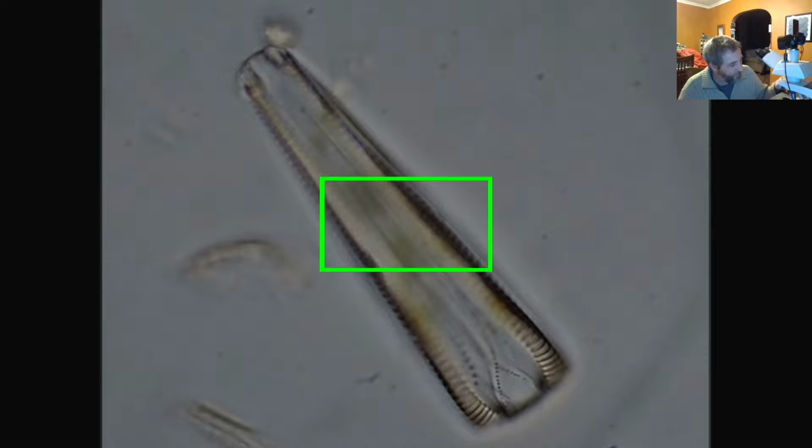That's what's called bright field. Dark field is similar, except there's something in there that causes the light to bend around it, and then you're getting oblique lighting. You can also get dark field from shining light sideways or from above, so sometimes people do that. Apparently Stanford has one they made. Well, lots of people have it.